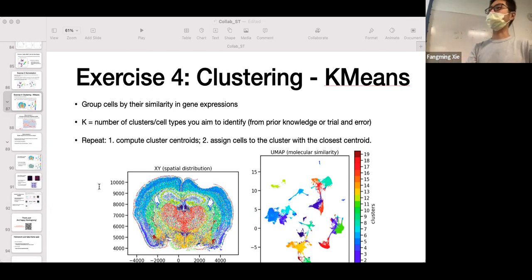What we want to do are 2 things. One is to merge all cells belonging to the same cluster together. And then we take the mean for every gene: the mean expression level of every gene across all cells belonging to that cluster, and apply it to all the clusters. It's a mouthful, but command-wise, it's not that complicated. So what do we do? Let's create a temporary data table that makes a copy of the original feature matrix. Then we're going to mess with it, so we keep our original version.